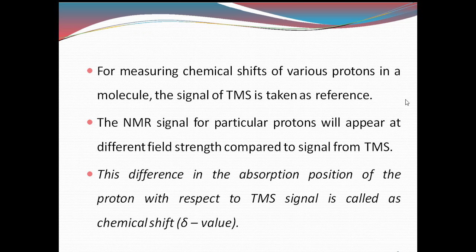So for measuring the chemical shifts of various protons in a molecule, the signal of TMS is taken as a reference. TMS is taken as a standard one. Why? Because it will give a correct signal. That's why TMS is taken as a standard compound.